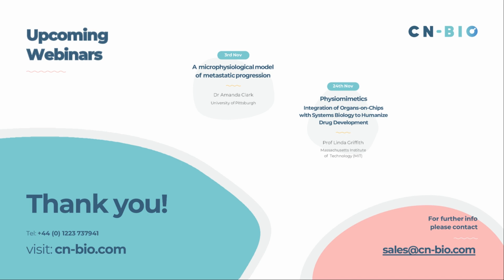This often takes some optimization, and we think about how, for example, one organ might be phased out of its own media over a few days before it's brought onto the platform for the multi-organ study, rather than an aggressive switch between one media and the other. So yeah, there are different protocols and different setups for different multi-organ experiments.